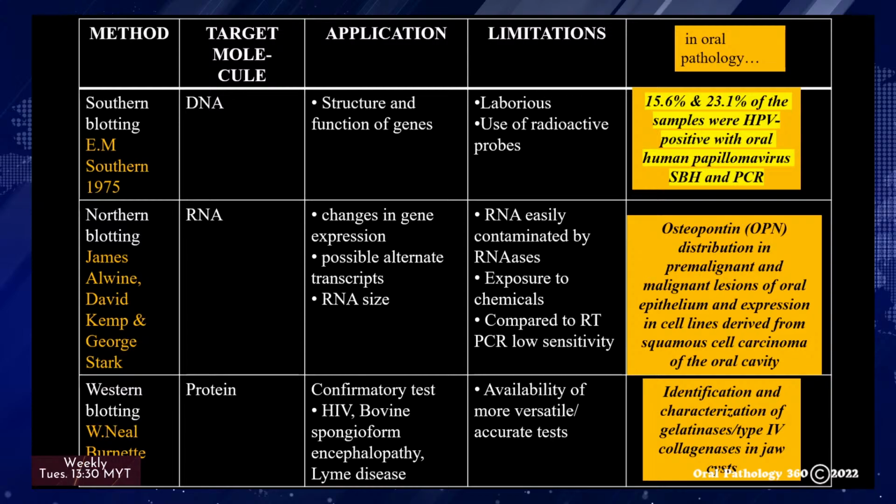The other blotting techniques that emerged from this method have been termed Northern for RNA, Western for protein, Eastern for post-translational protein modifications, and Southwestern for DNA-protein interaction blotting. In Northern blotting, a nylon membrane with a positive charge is most effective for use since the negatively charged nucleic acids have a high affinity for them. The transfer buffer used for the blotting usually contains formamide because it lowers the annealing temperature of the probe RNA interaction, preventing RNA degradation by high temperatures.